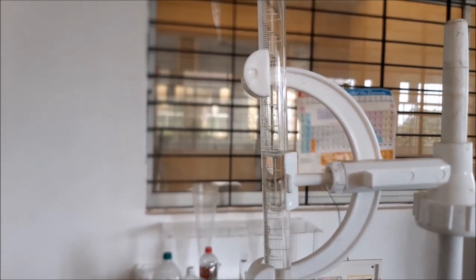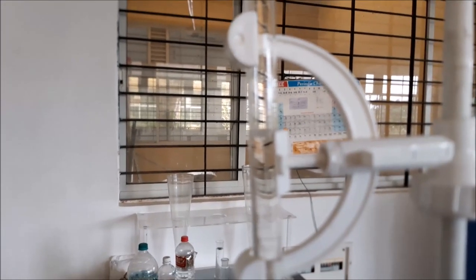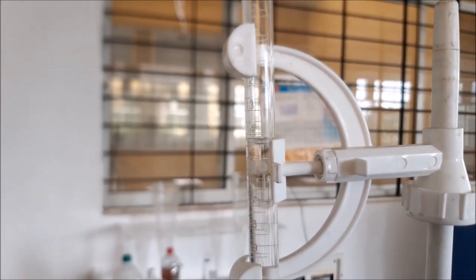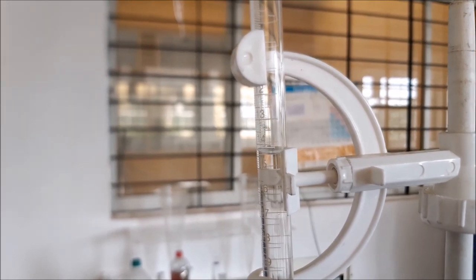Repeat the same procedure for the blank solution. Note down the burette readings for the blank solution where blank solution is your distilled water, then subtract the blank solution reading from the actual reading in order to get the residual chlorine value.